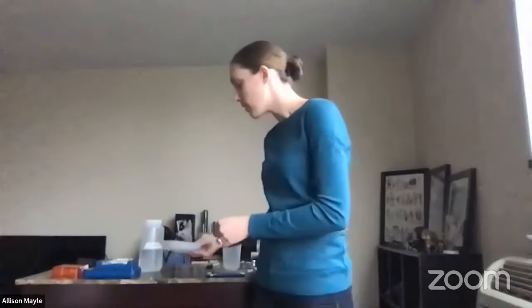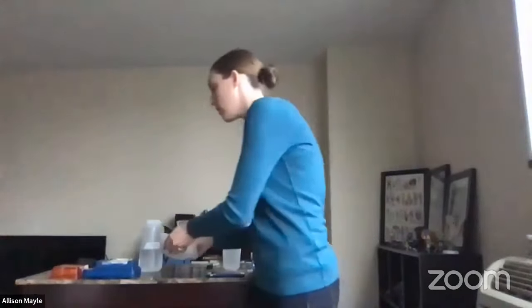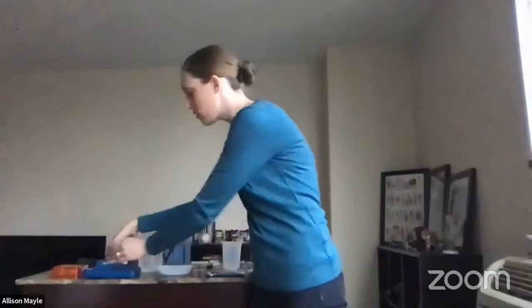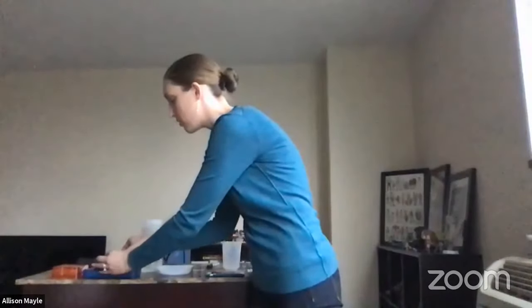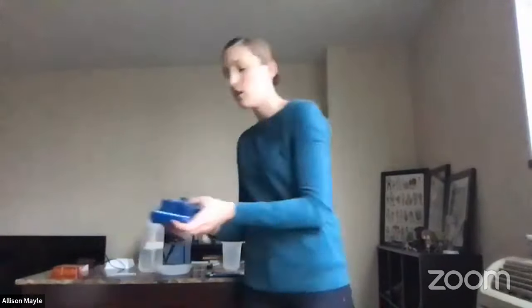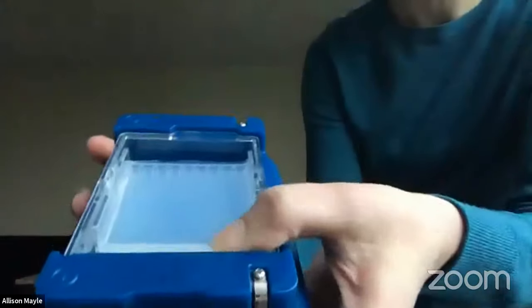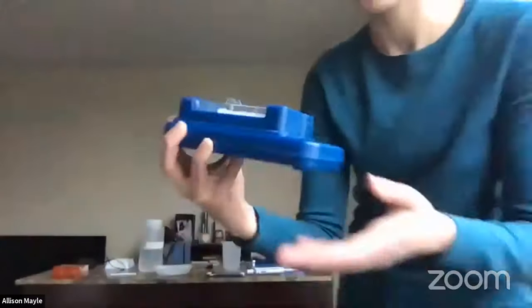Okay, so what you would do instead of just putting the liquid back into the tube like I did right now is you would have your gel set up in this little chamber, which I'm going to show you here. We have lots of different kinds of these at the Learning Center. This is the one I brought home with me. So you can see now the gel is just sitting inside this little plastic chamber. And there are some electrodes on the end. So that's how we're going to use our electric current later.